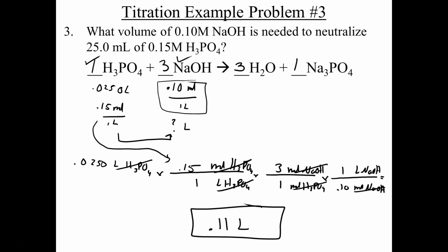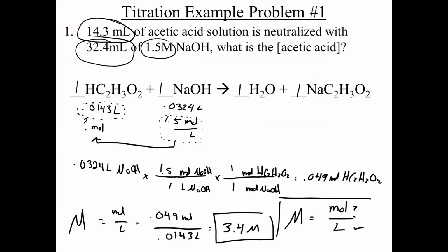And then you're going to use that as part of your stoichiometry in question number 2. You want to find the molarity of the acetic acid. So write your balanced chemical equation, which you actually have in the lab, and then that's part of your pre-lab, and then fill in your data like I showed you in the first example way back here, and then go ahead and solve for your molarity of vinegar. What you'll do then is compare it to an accepted value, find your percent error, and see how well you titrated. All right, if you have any questions, let me know.